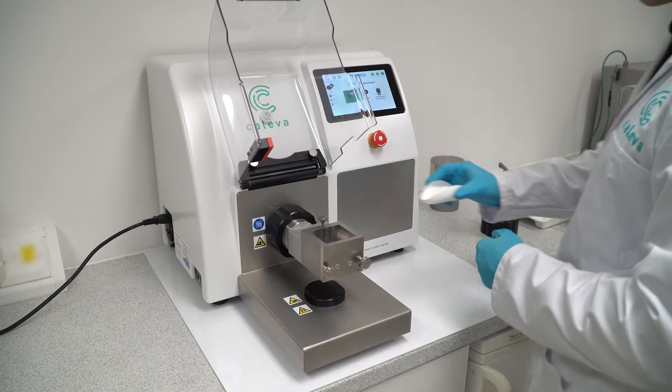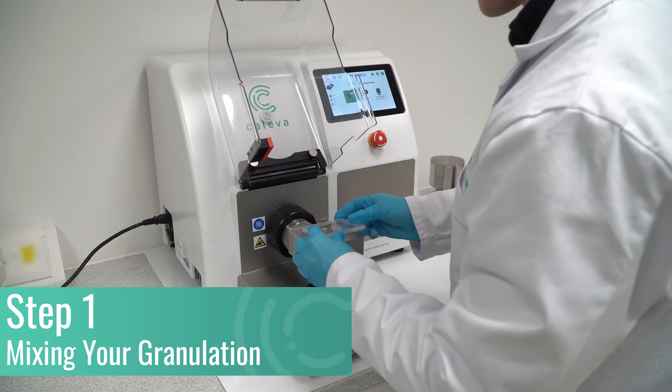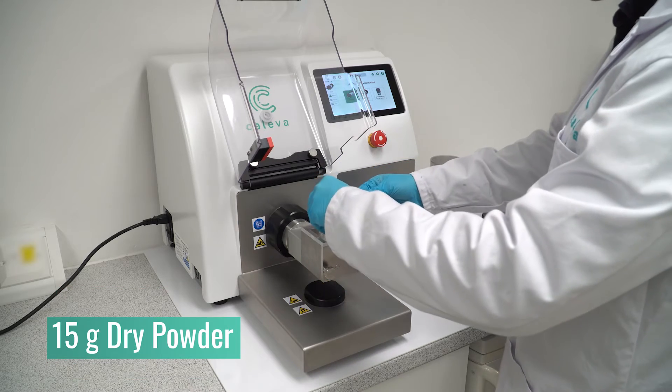The first of this three-step process is mixing your granulation. With the mixer attached, add your batch of dry powder. In this example, we are using 15 grams of dry powder.